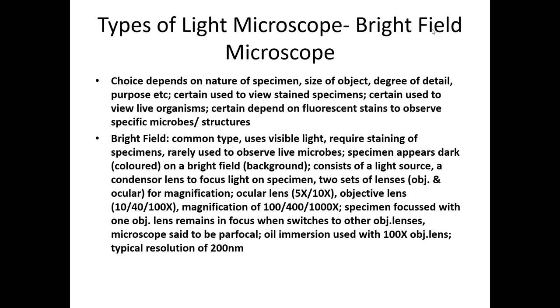Now, next point. The specimen focused with one objective lens remains in focus when switched to other objective lenses. Thus, the microscope is said to be parfocal in nature. So, what do you mean by parfocal? See, when we are observing through the microscope, what are we doing? First of all, we will mount the slide on the stage.